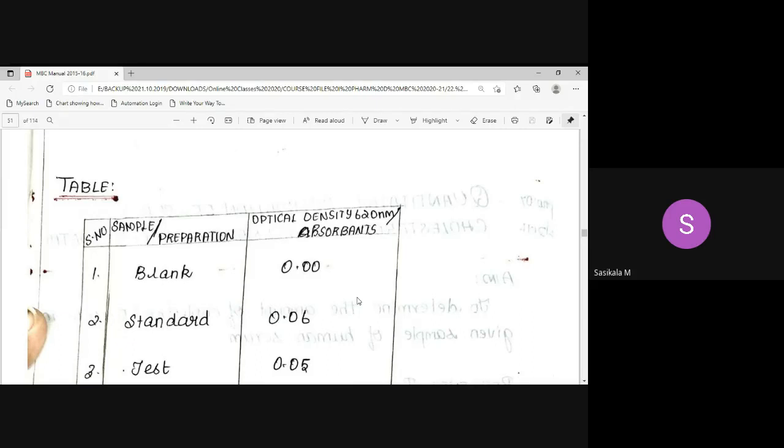Now I have given explanation of whatever you are going to do according to your manual, and it is referred from the practical manual only. Procedure is referred from practical manuals available. Then according to the PCE syllabus, this experiment is prescribed in your syllabus, so based on that it is designed to explain to you. Is there any doubt now? Have you all noted the readings?